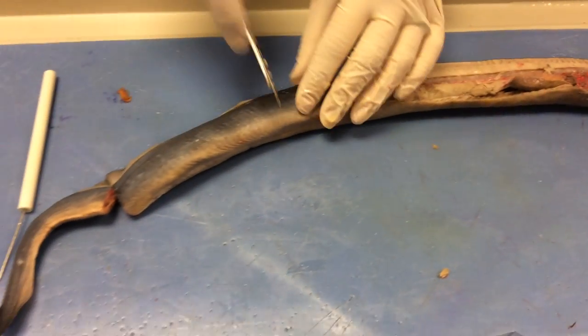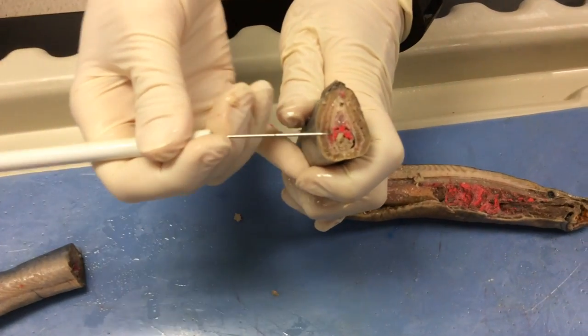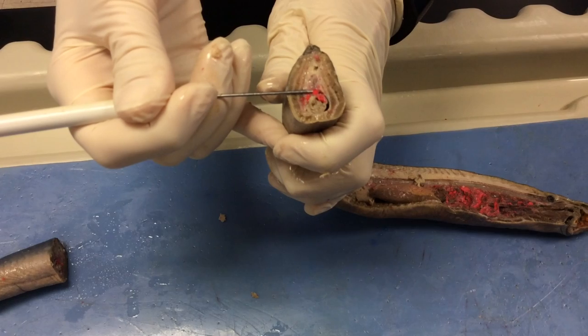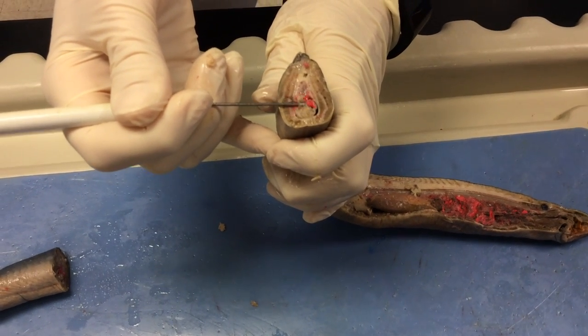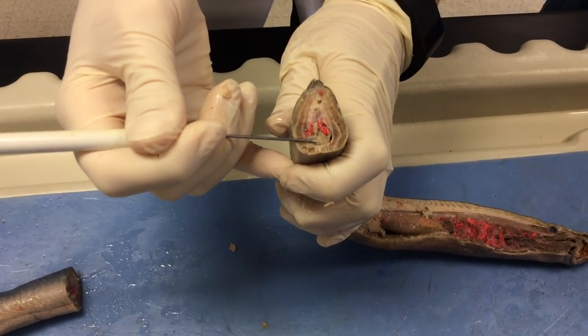If we were to take a cross-section of this organism, as shown here, you can see the following: the spinal cord, the notochord, and the dorsal aorta. This area is the egg region, and then this tube down here at the very bottom is actually going to be the intestines.